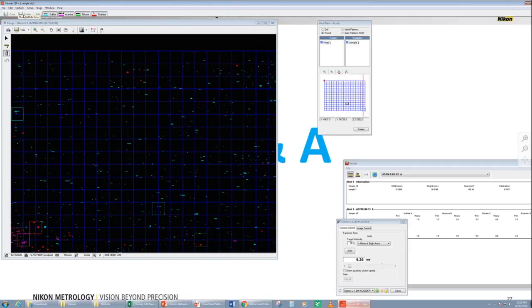Yes, it would be normal to check them, but normally, if the sample prep is good, you would take about 15 to 30 seconds per sample to validate it, because you need to check not all the inclusions, but all the worst field. Once you have the worst field correct and the polishing is good, normally 1 or 2 steps at worst, and then it's a typical procedure that doesn't take a lot of time.